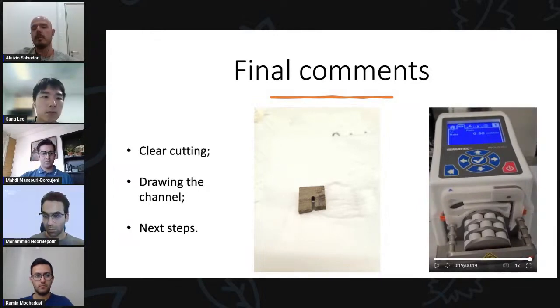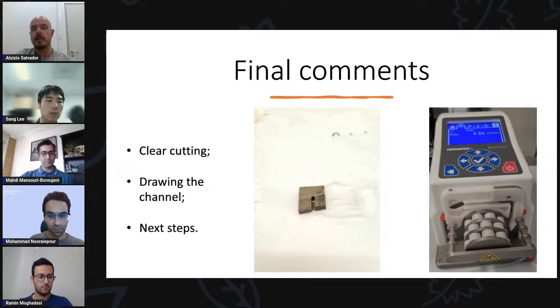This low flow is to allow the solution to interact with the surface in the channel as many times as possible without the solution going too deep in the pores, since our interest is not in understanding how the solution reacts inside the pores, but just on the surface. And we saw that the Kapton tape did its work in the sealing. We didn't have leaks.